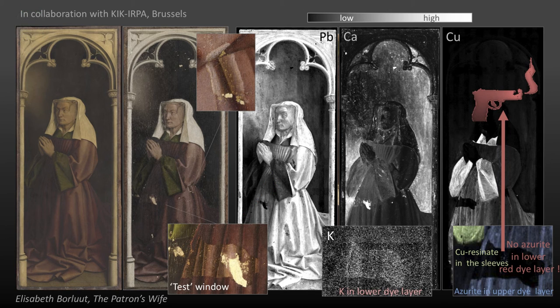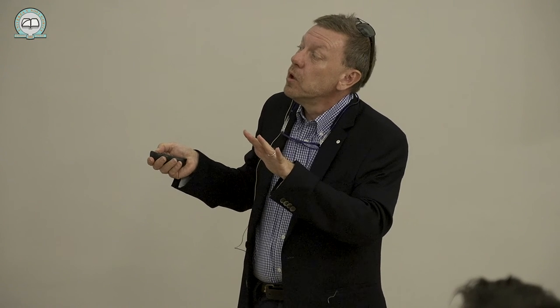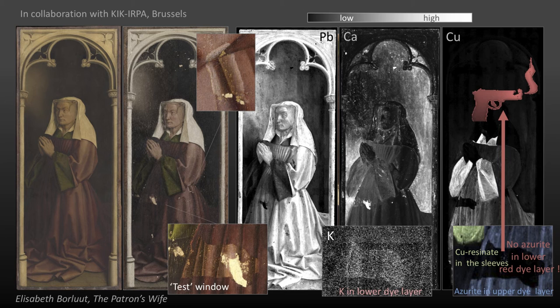So they asked us to clarify this, to find indications of a chemical difference between the lower dress and the one on top. Although, generally speaking, they're both painted with a red lake pigment, which is an organic lake, the same. So we scan this, and on first sight you don't really see too much difference. But there is a big difference when you look at copper. There is a lot of copper here in the green sleeves. That's normal. A lot of pigments that contain copper are green. But there is also copper in the red dress, which was very strange, which nobody understood. And in this window, which was opened into the lower part, there is no copper. So there is only copper in the upper level, which was a lucky break for us because we could more easily see where the upper layer was, and it was everywhere.